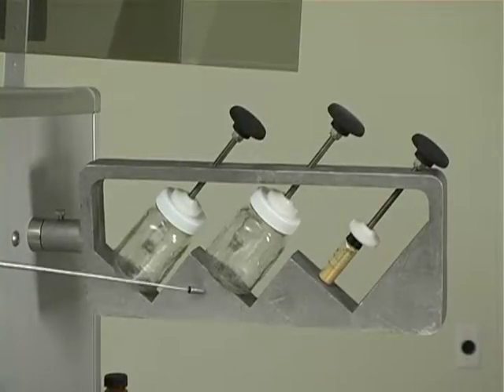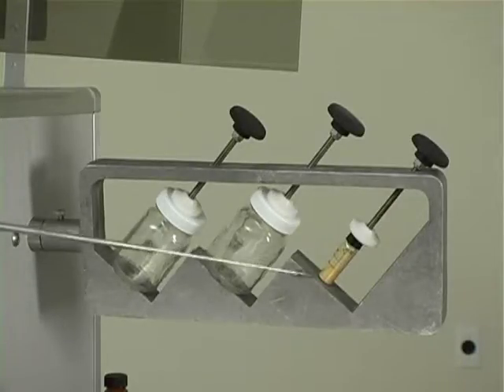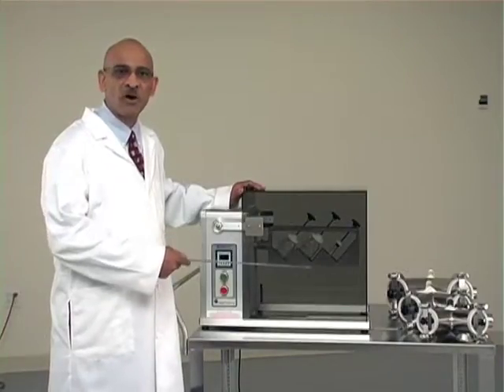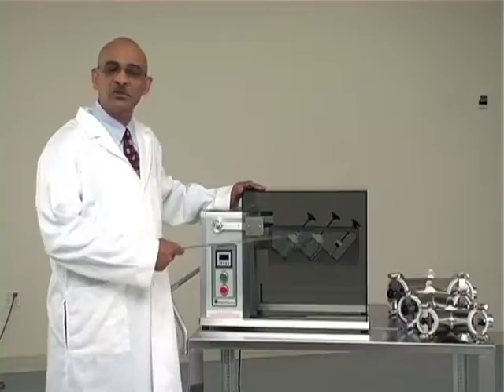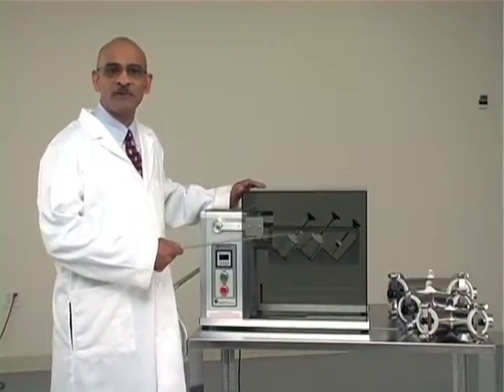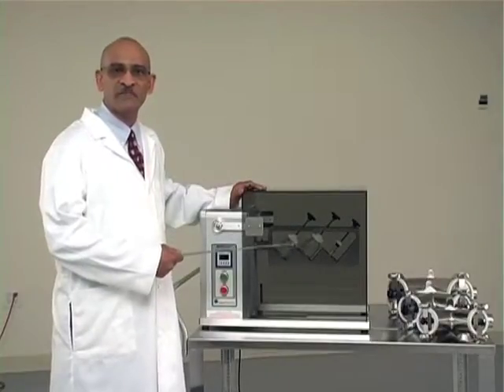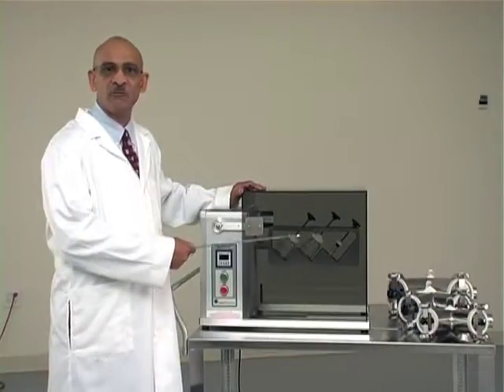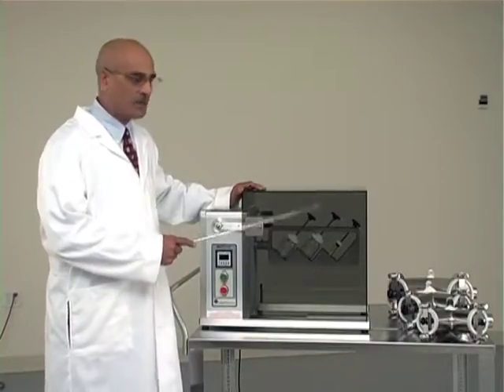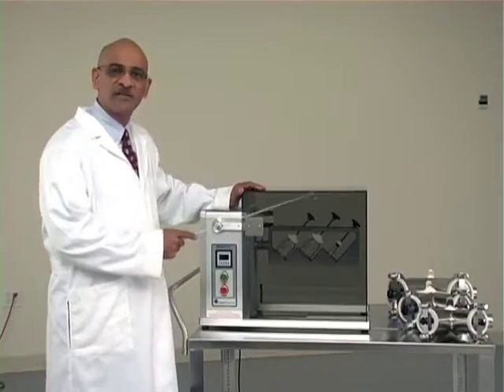The bottle blending attachment can accept 3 different containers: glass bottles, plastic bottles, or small vials. You can mix quantities from maybe 2 grams all the way up to about 50 grams, depending on the size of the bottle or vial you are using on the bottle blending attachment.